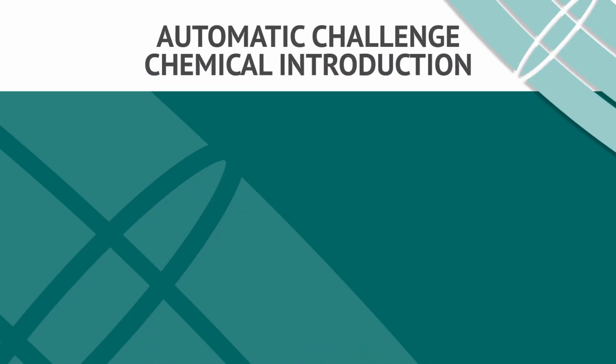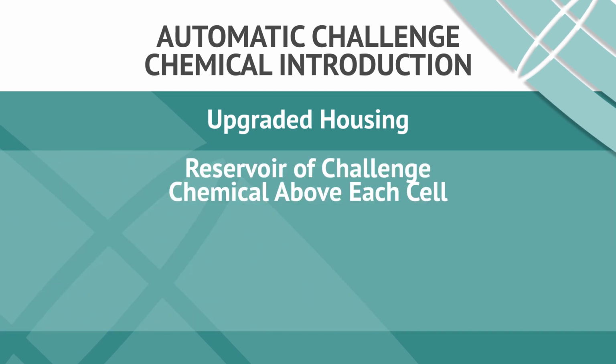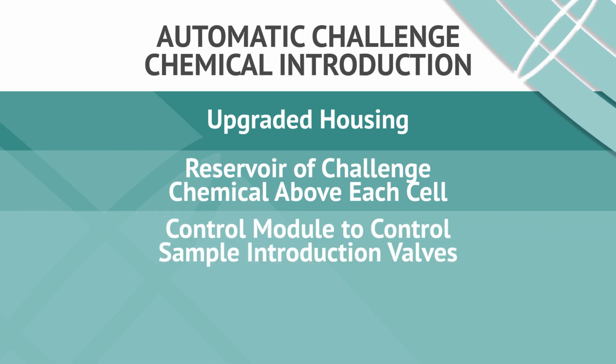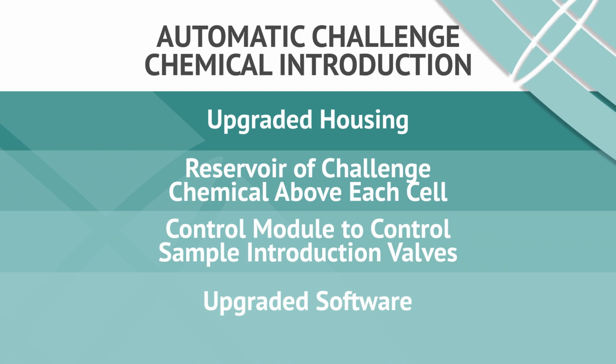The system is very similar to the manual system, but features an upgraded housing, the addition of a reservoir above each cell that's filled with the challenge chemical, a custom control module to control the sample introduction valves, and upgraded software to further automate the system.